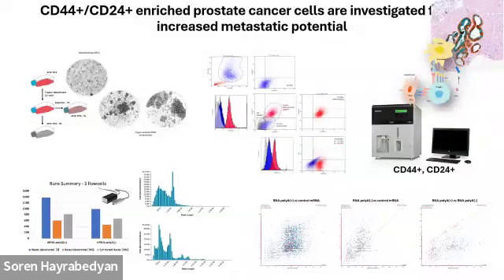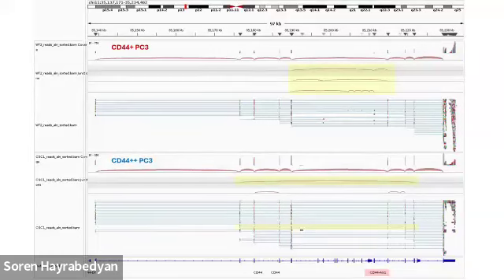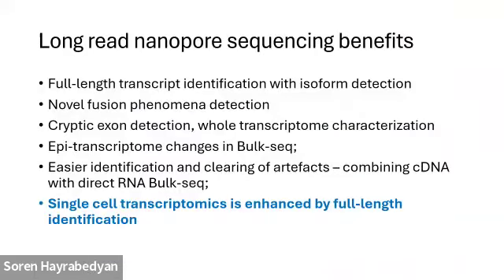So when we compared with very deep sequenced PC3 cell line on Illumina, there are still some molecules that Illumina didn't detect. So this is actually where we get our interest. As you see, the CD44 in the wild type adherent cell line, compared to the stem cell enriched cell line, have different isoforms. So there is an isoform switch when you actually promote the stemness.